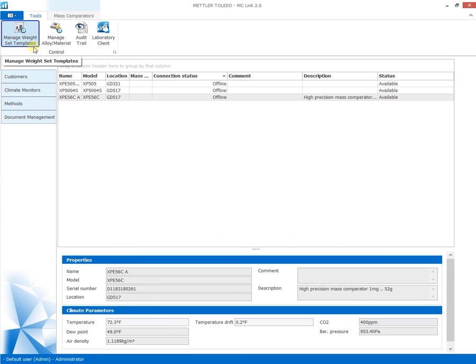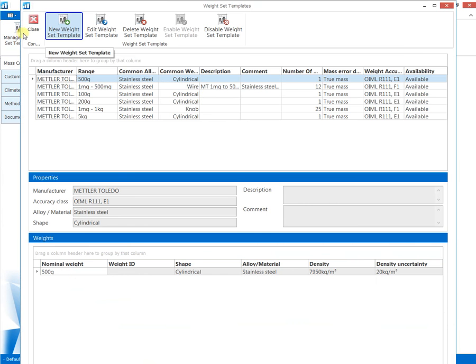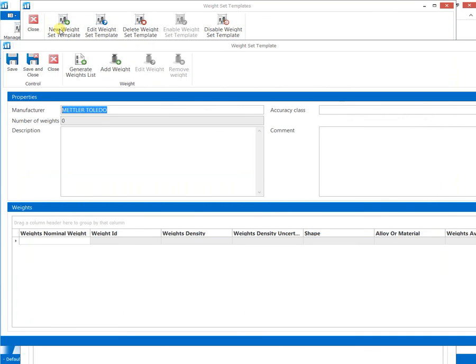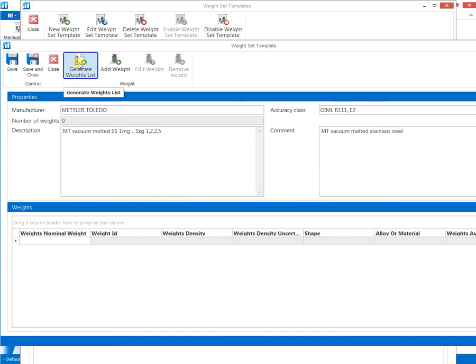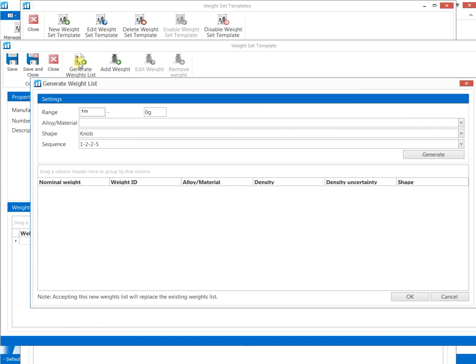Weight set templates are generated by defining the accuracy class and the configuration of weights contained within the set. The structure of the weights is defined with a few clicks using the smart weights list generator.